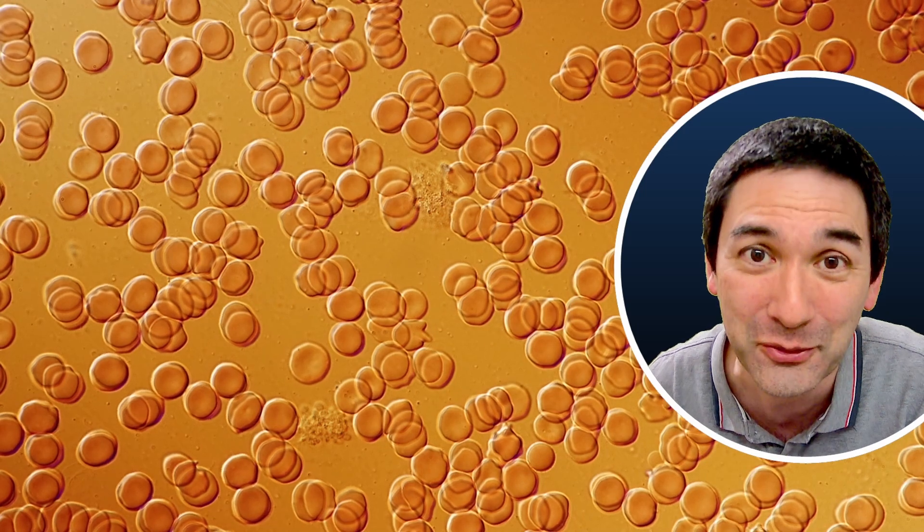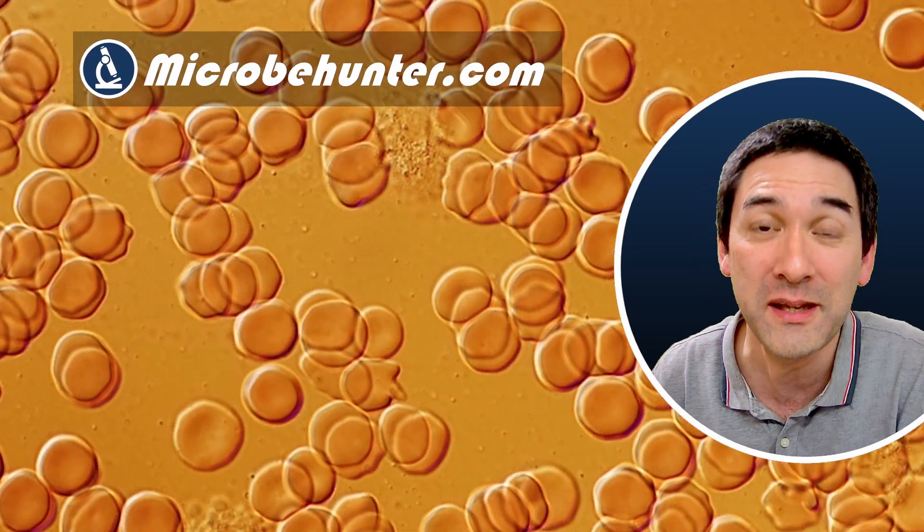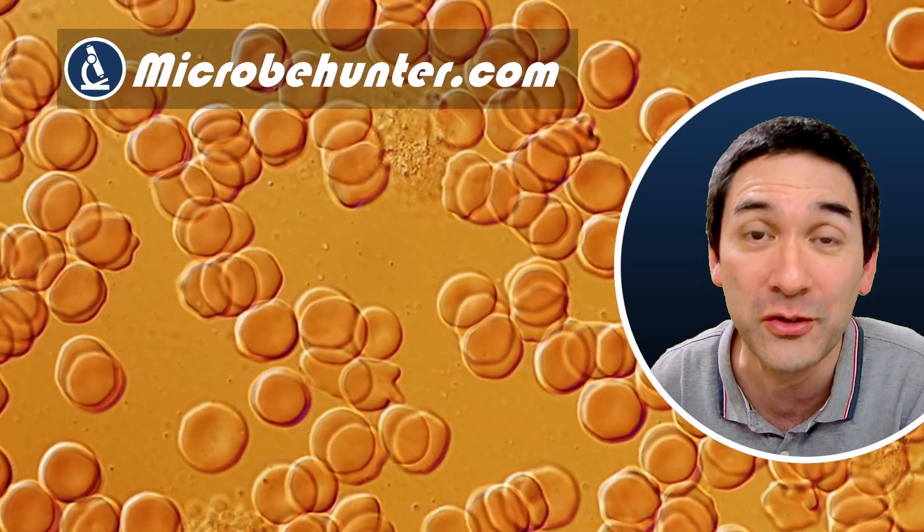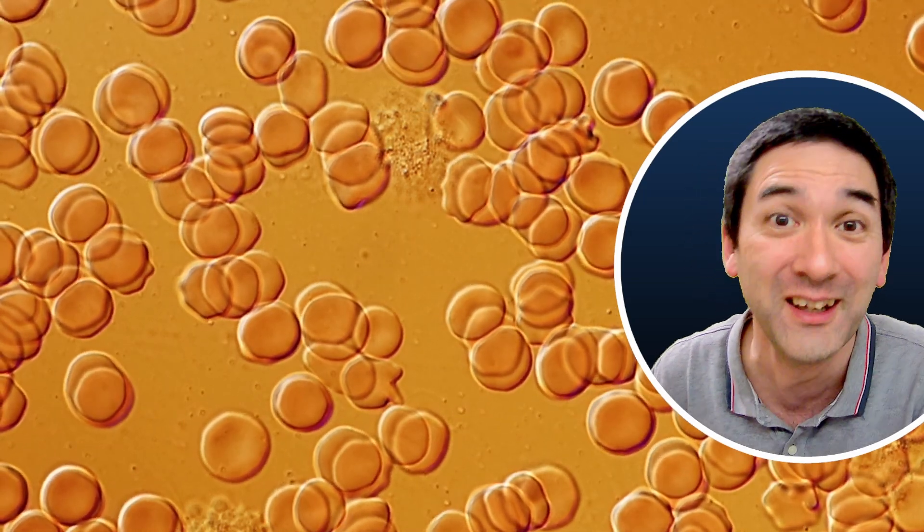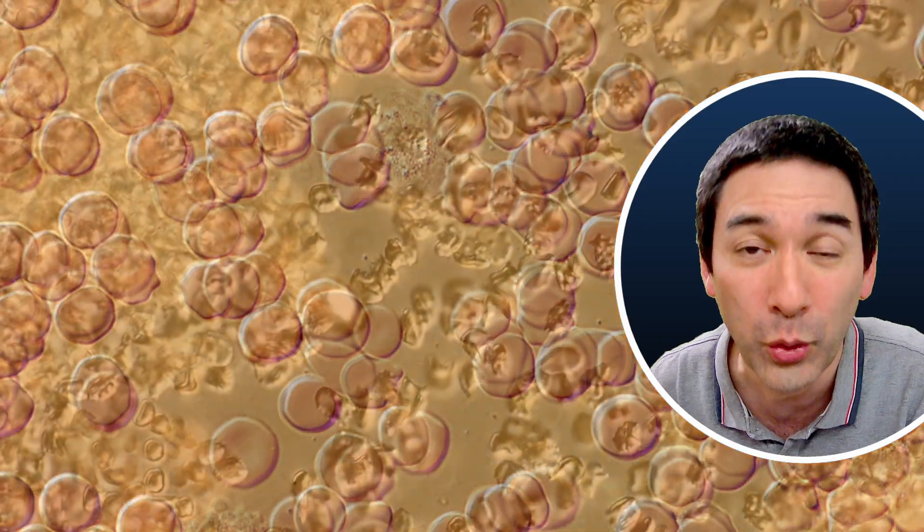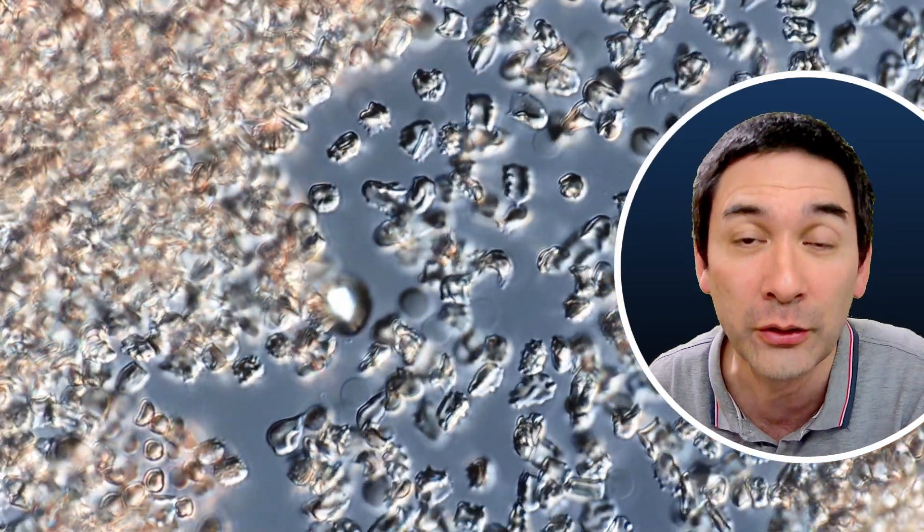Hello and welcome, microbe hunter here. And that's basically, these are my red blood cells that you see. And you see that they're very nice and round, but not very much longer because I'm going to add a little bit of salt water to my red blood cells. And after just a couple of seconds, look how they look like.